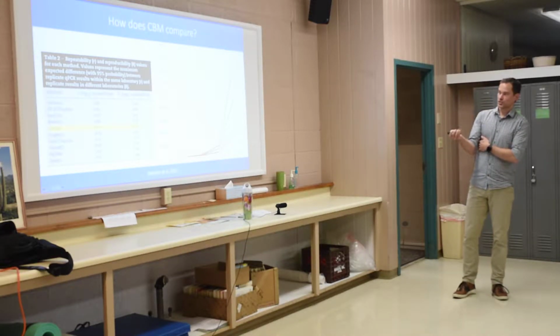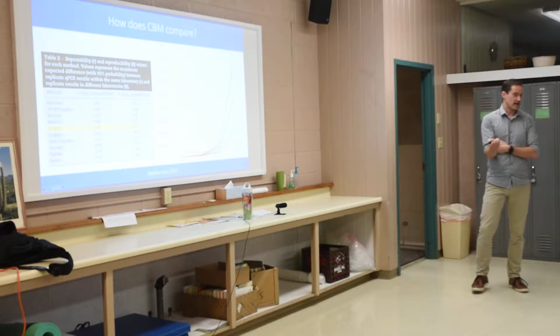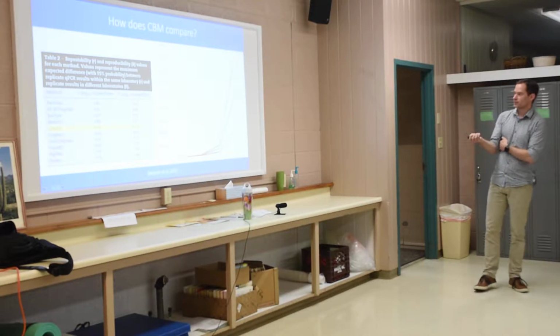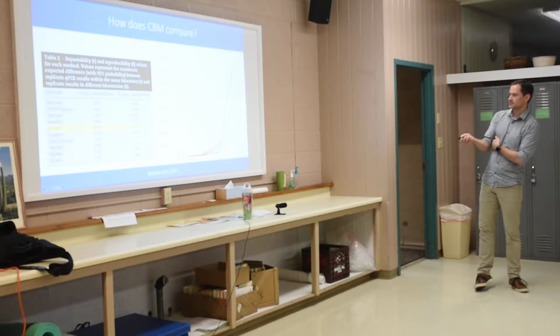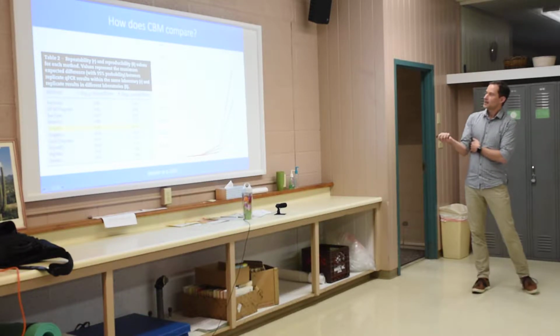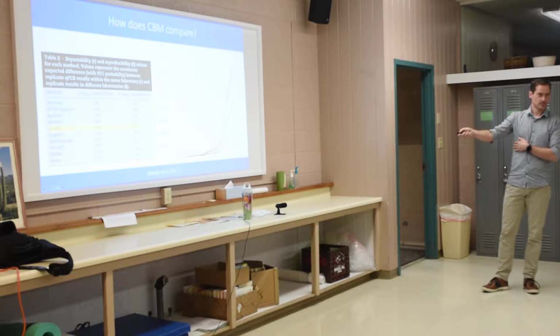Where our Swimmer's Itch qPCR test falls is around a 0.28 log 10 copies per filter difference. That's our maximum difference. If you were to map what that looks like, because I think a graph shows this better, this would be the actual copy number that you would get. So this would be, say, a million, 10 million, 100 million, a billion. The point, though, is that if you map what this log variation means to the actual number of copies in your sample, this is what it looks like. This is the variation that you would see in that sample.